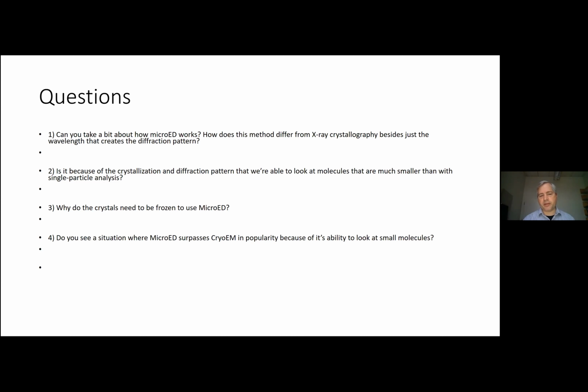But it's hard to predict the future. I think probably more and more people are going to be wanting to look at bigger things and looking at kind of molecules in context. So although I think MicroED will keep growing in popularity the easier it gets to do.